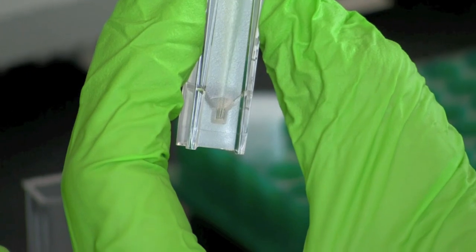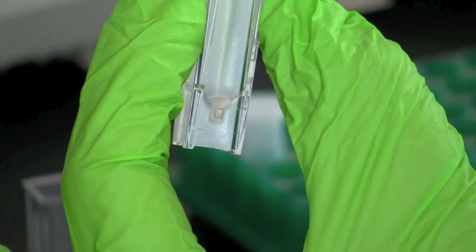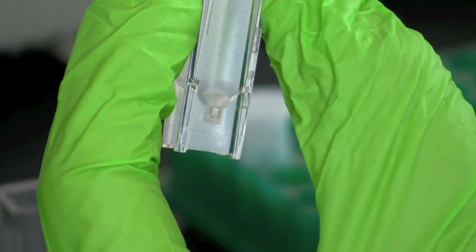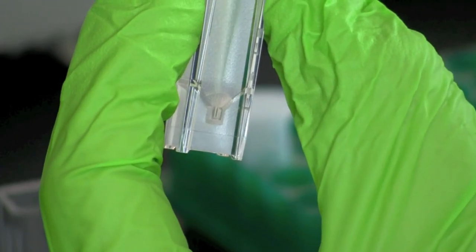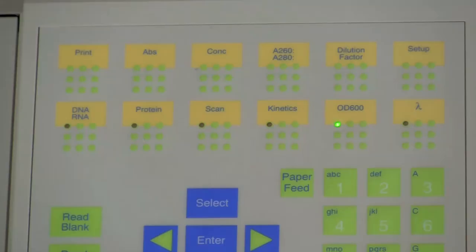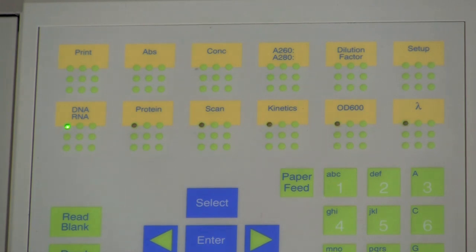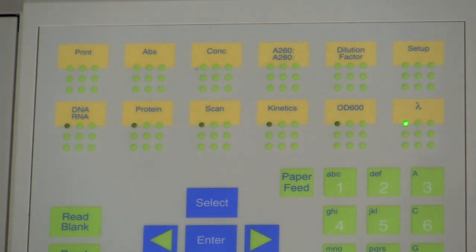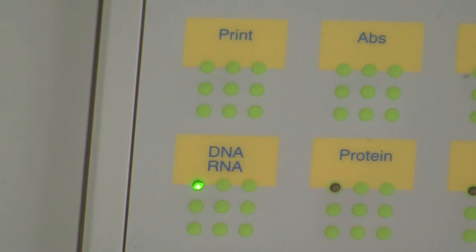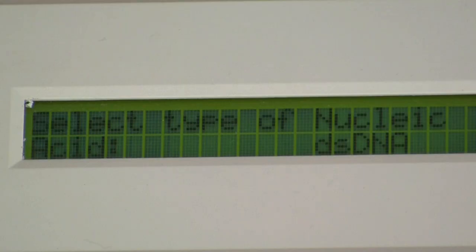Pipette up and down to mix the sample. Set the spectrophotometer to its DNA quantitation setting. Your screen should show that you have selected for DNA.